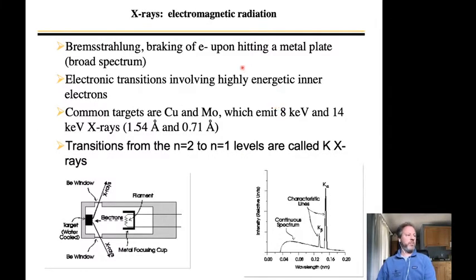Okay, so X-rays are electromagnetic radiation. How do we make X-rays? How do we generate X-rays? So if we look down here, and on the next slide, I have a picture of our instrument. So we have a filament, presumably this is a vacuum chamber of some sort. This filament is under electric field. You get electrons hitting this target, and our target is molybdenum, so we're using molybdenum radiation. And X-rays come out of these windows on the sides of the target.